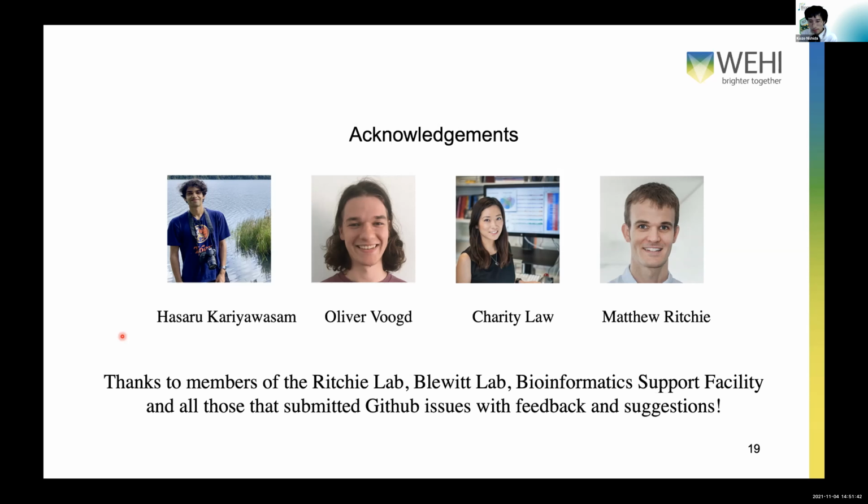What are the reasons behind plotting the results in Vega instead of Plotly or RBokeh or HighCharter?